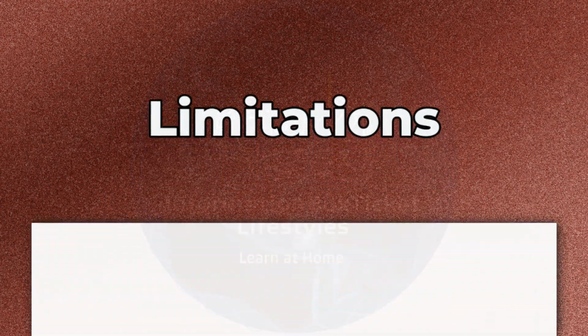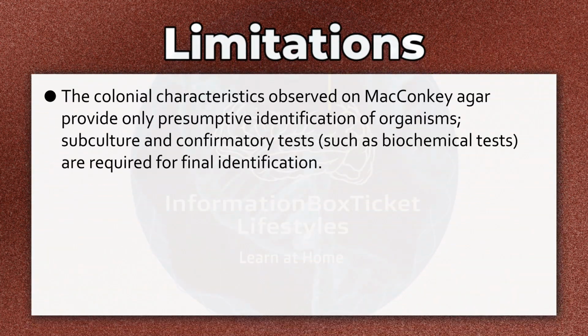Limitations of MacConkey Agar. The colonial characteristics observed on MacConkey Agar provide only presumptive identification of organisms. Subculture and confirmatory tests, such as biochemical tests, are required for final identification.